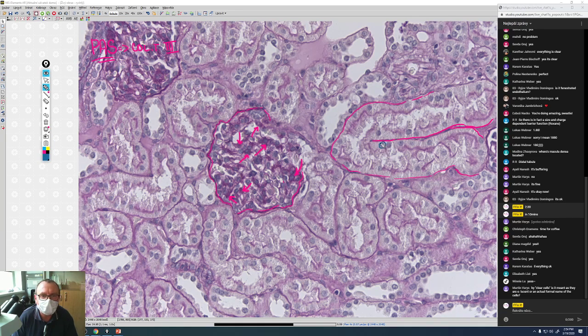So I can be sure that it is a proximal tubule, because we can see only few nuclei, long segments of a wall without any nucleus, and also an irregular luminal surface where there is brush border.